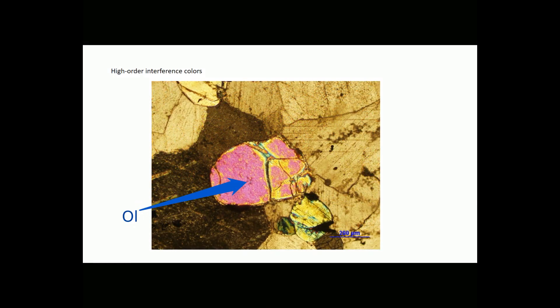The grain in the middle of this view is olivine, which has slightly greater birefringence than epidote. Olivine also has no cleavage, although you can see some fractures in this grain. Below and to the right of the olivine, there is a grain of pyroxene. This grain shows cleavage, which is one way we can sometimes tell olivine from pyroxene in thin section.